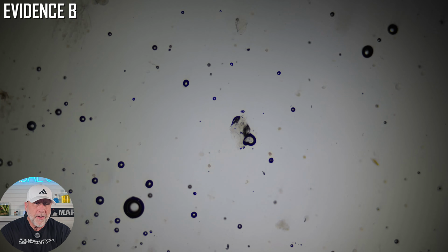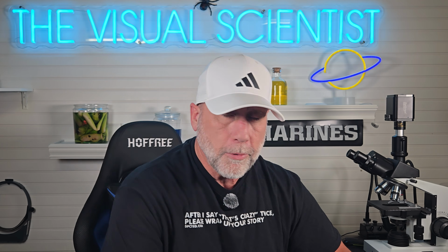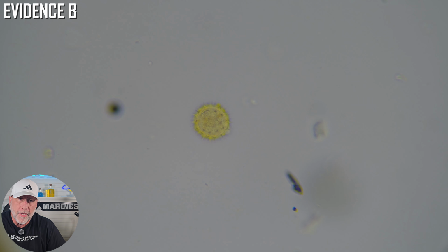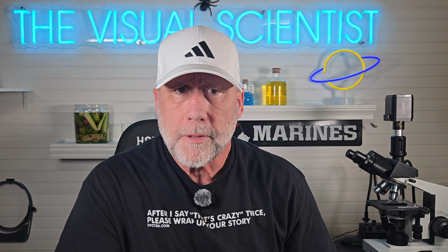Evidence B, the little cute bear, 40 times. Significantly more fluid, much more translucent. At 40 times, this already looks nothing like evidence A. So we're going to 100 times. Okay, so almost no structural patterns at 100 times. Where evidence A was showing geometric shapes at this level, evidence B is almost completely clear. Let's go to 400 times.